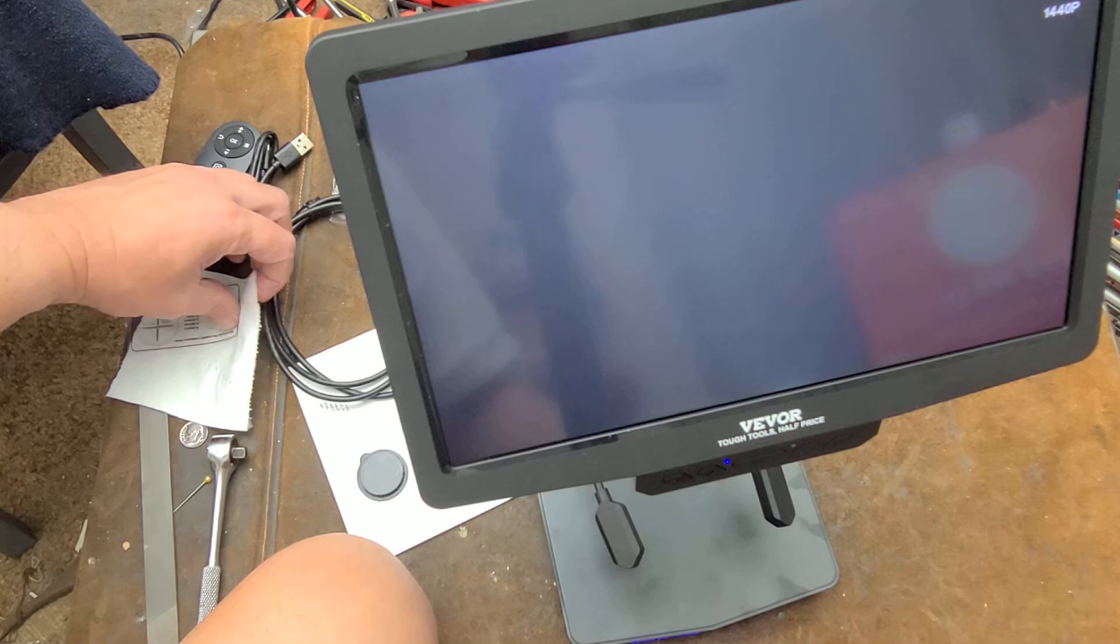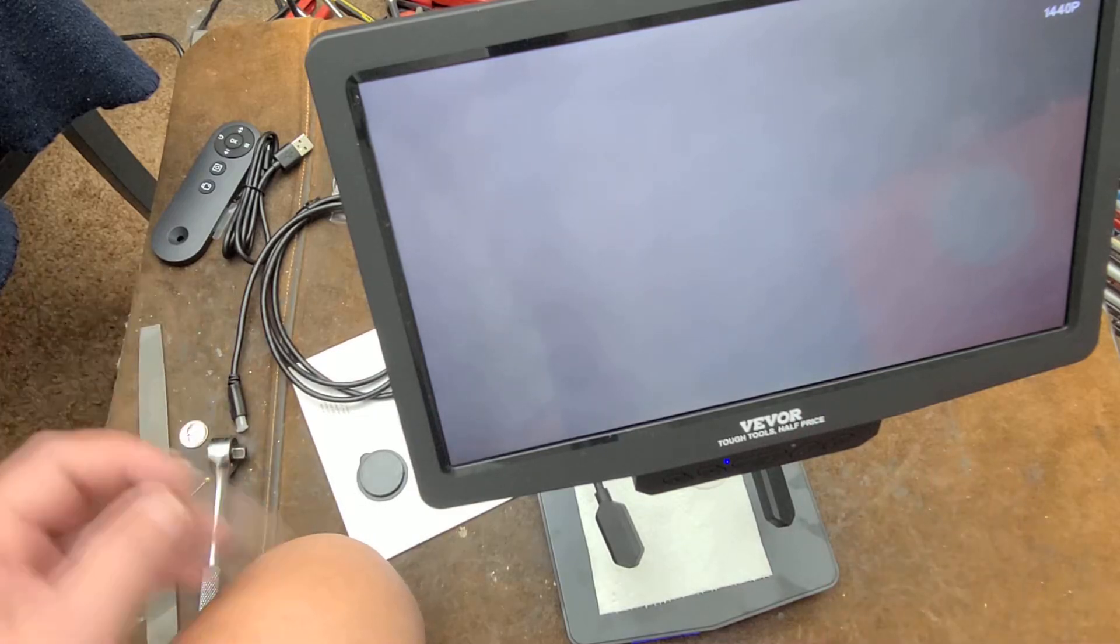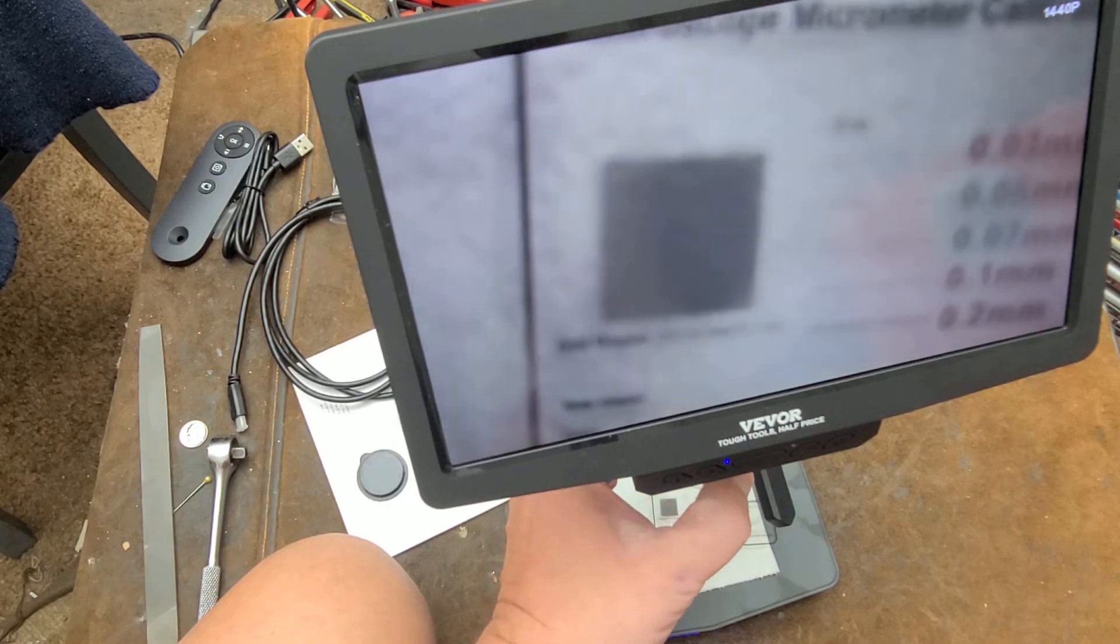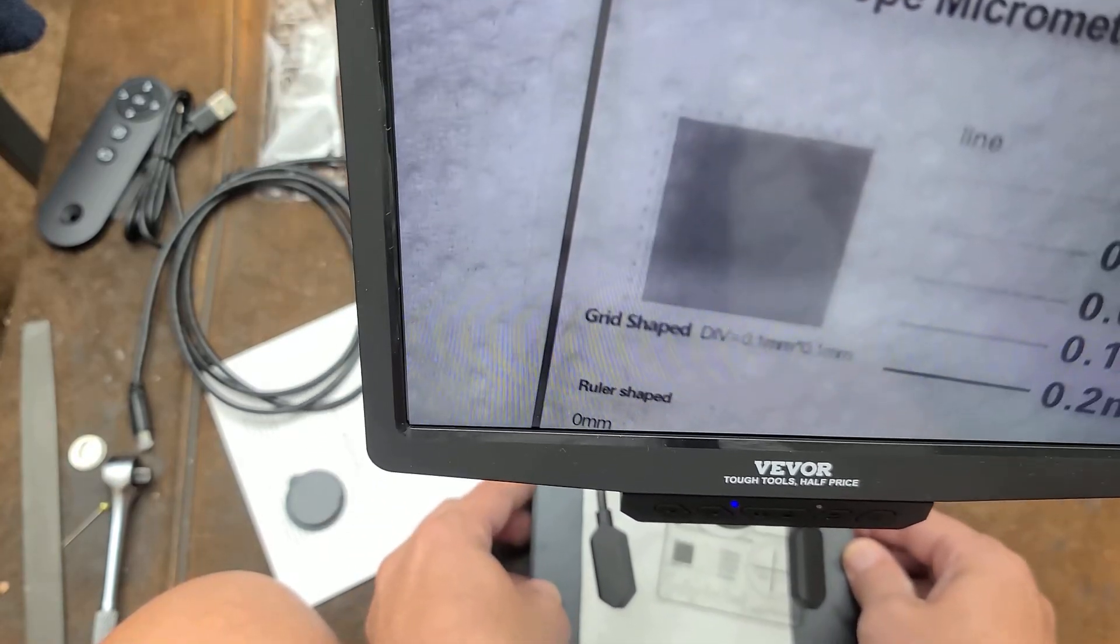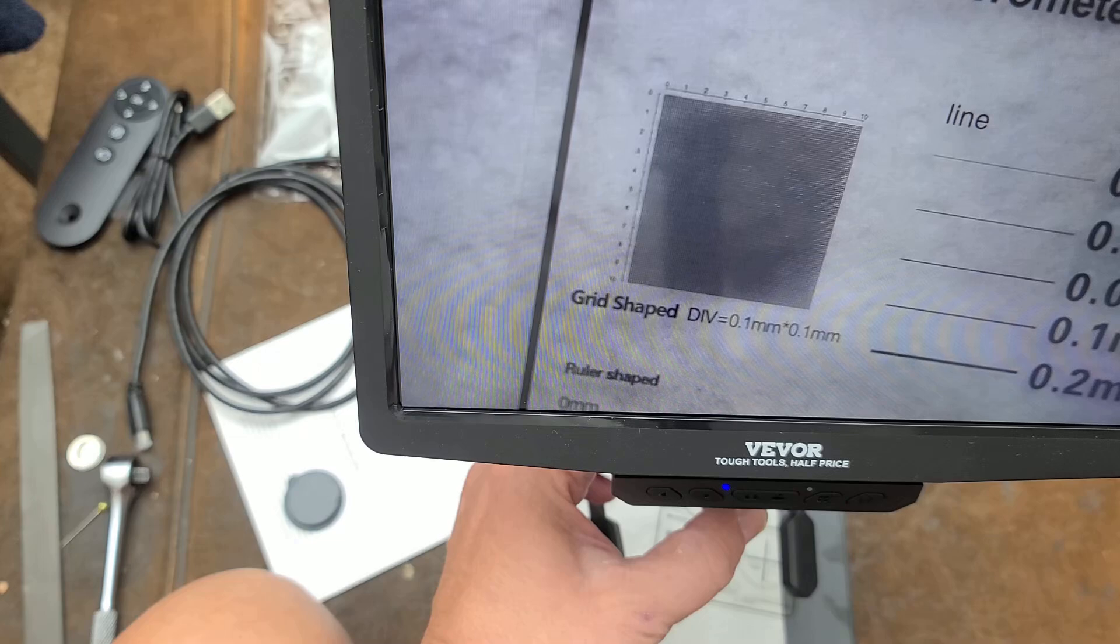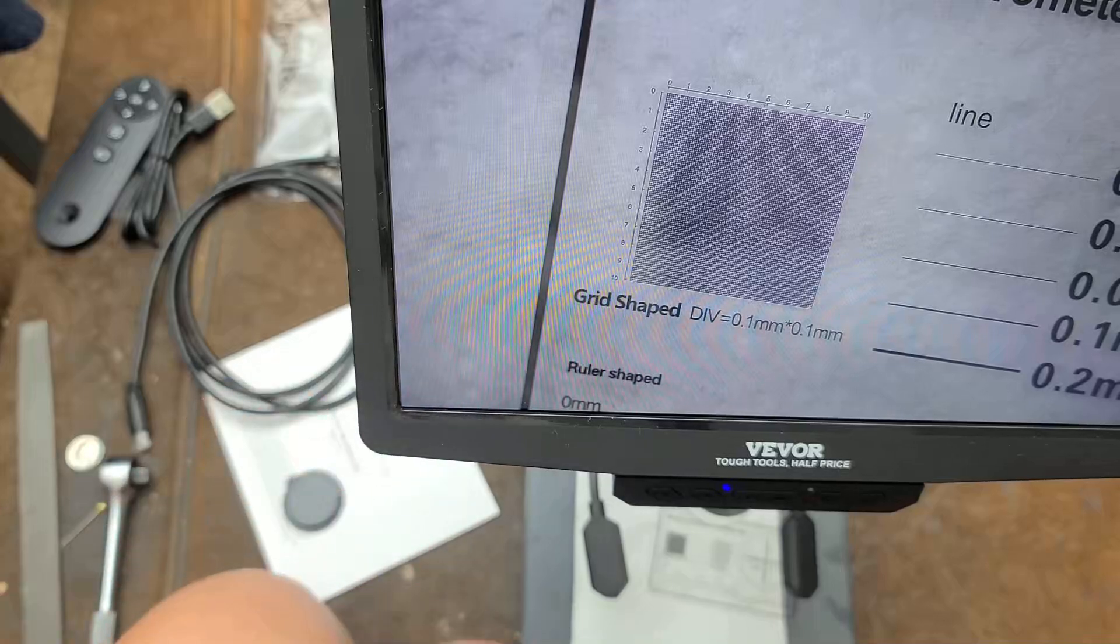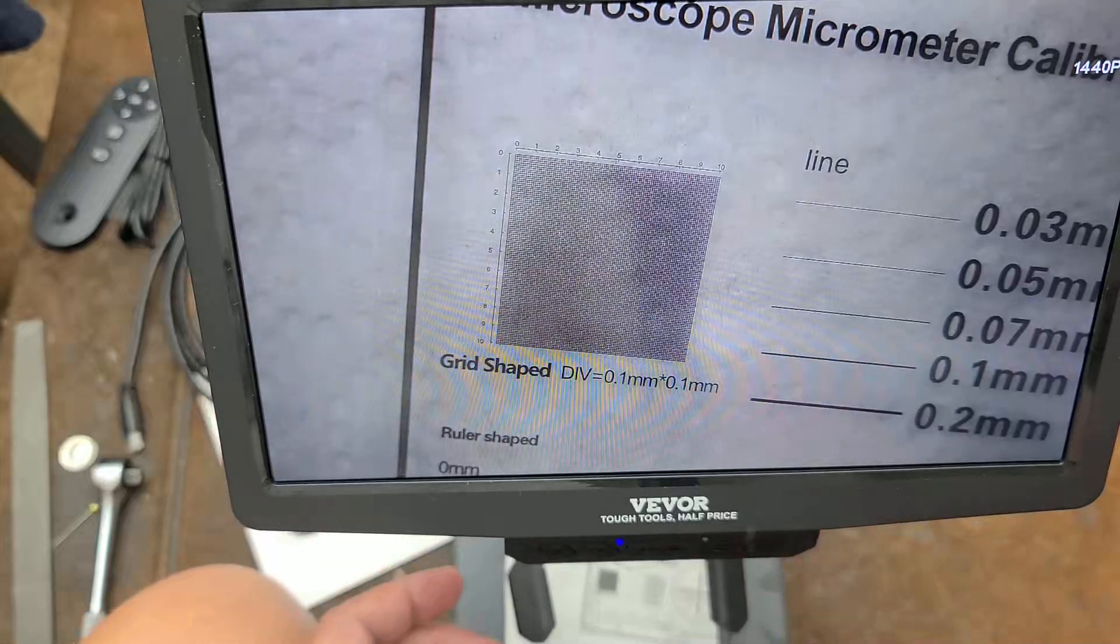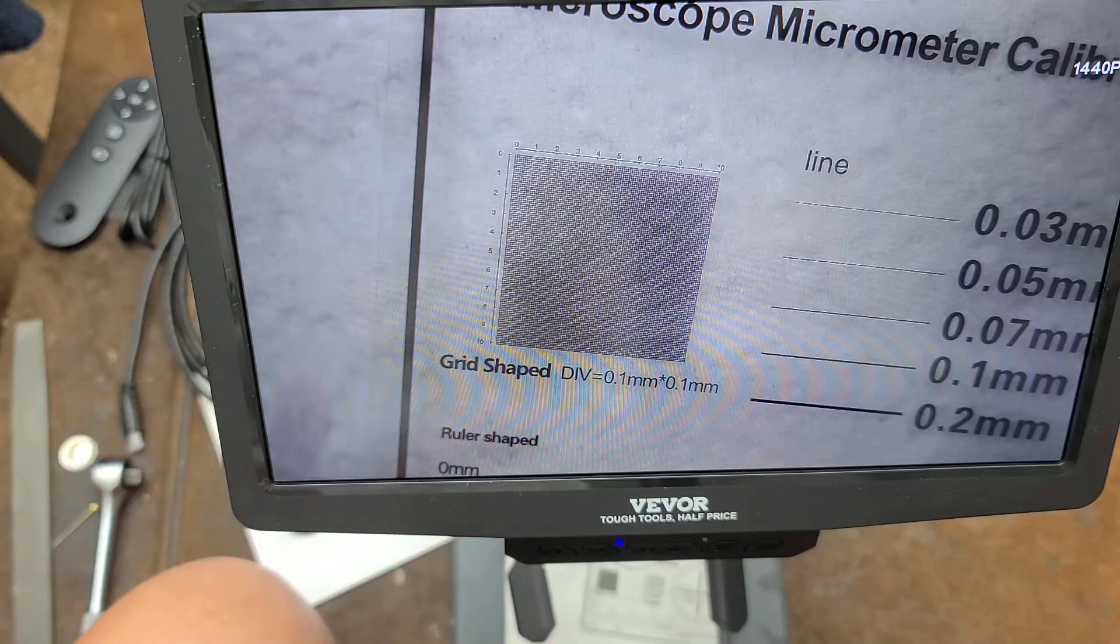That's the easiest way to say it. These things are kind of decent and I've been waiting until I could get a hold of one of these with the bigger screen. That's one of the biggest deals is having a pretty big screen. They're advertising 1300 times zoom, but that's a maximum with digital.